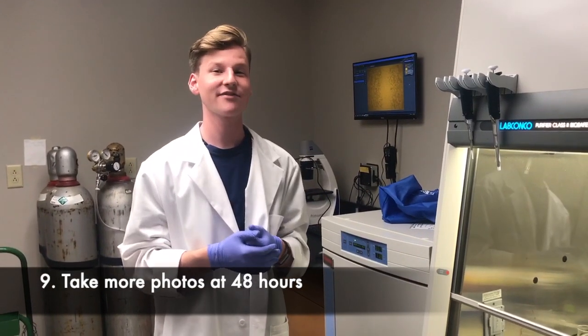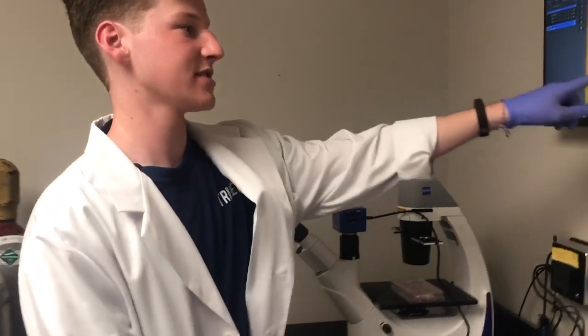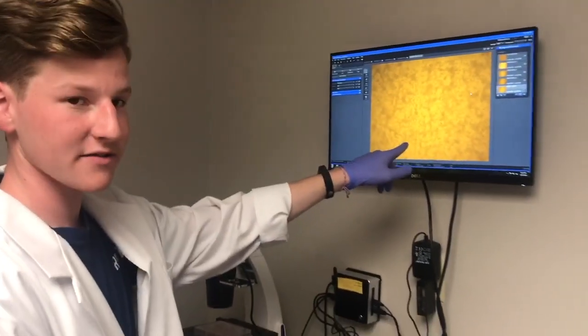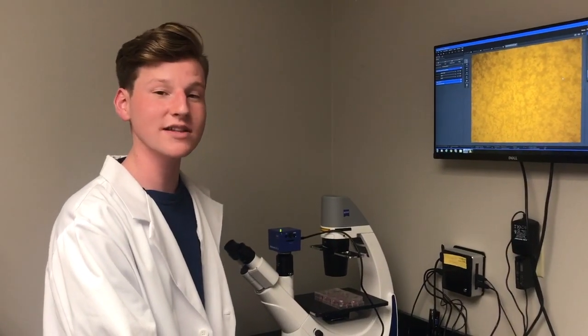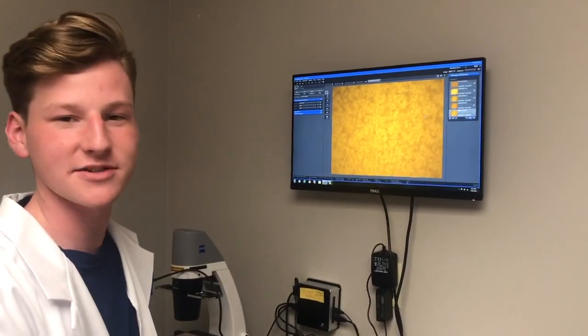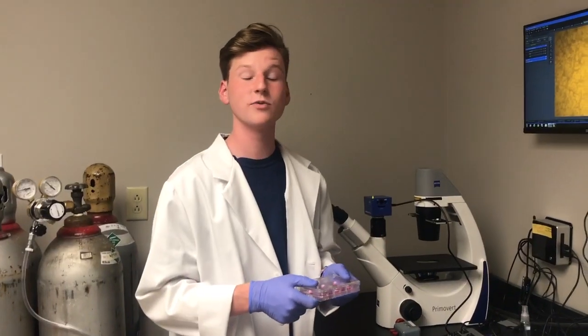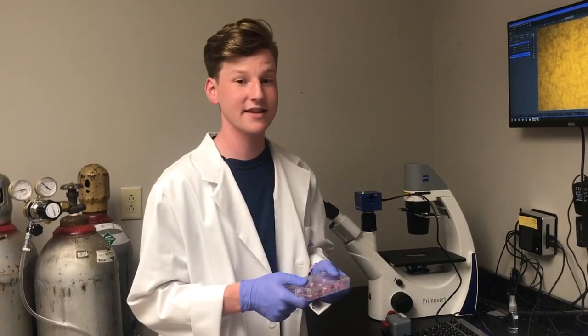It's now the next day and we're going to take our 48-hour pictures. At 48 hours you can see that the cells have most likely moved all the way back over the scratch and are covering the plate again. If you want to take quantitative as well as qualitative data, you can use a microscope to measure the gaps, but that's completely up to you. If you want to take more time-point pictures you can, or if you're done go ahead and clean up — and that's your scratch assay.